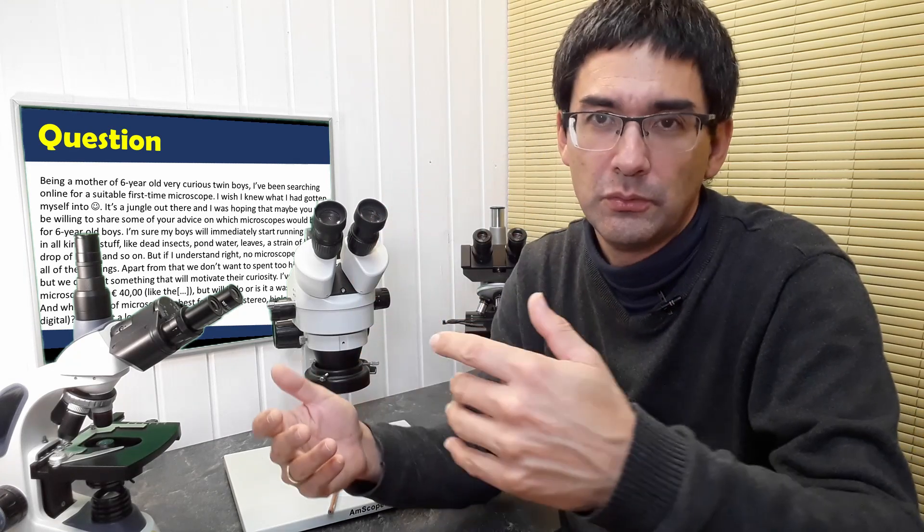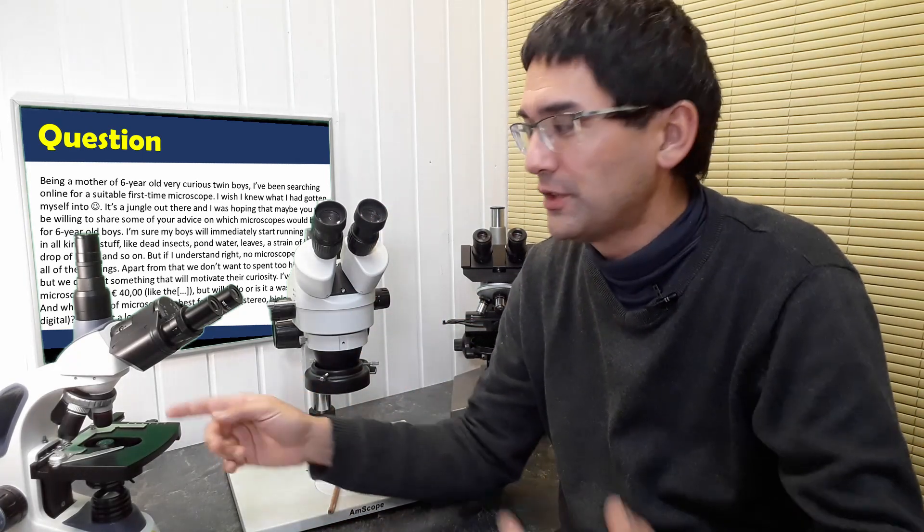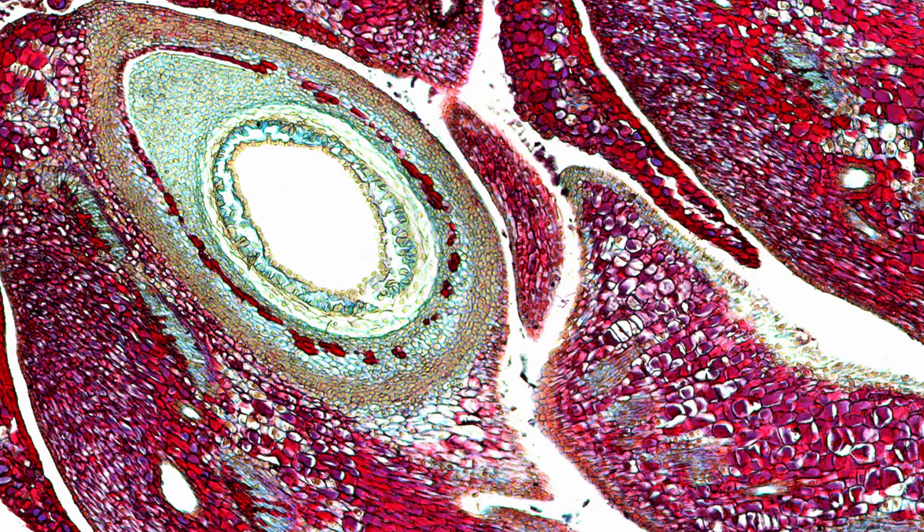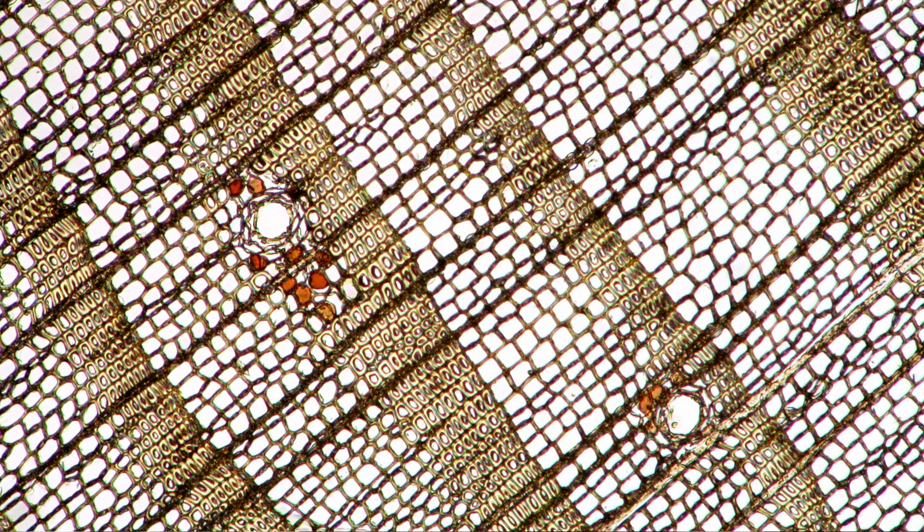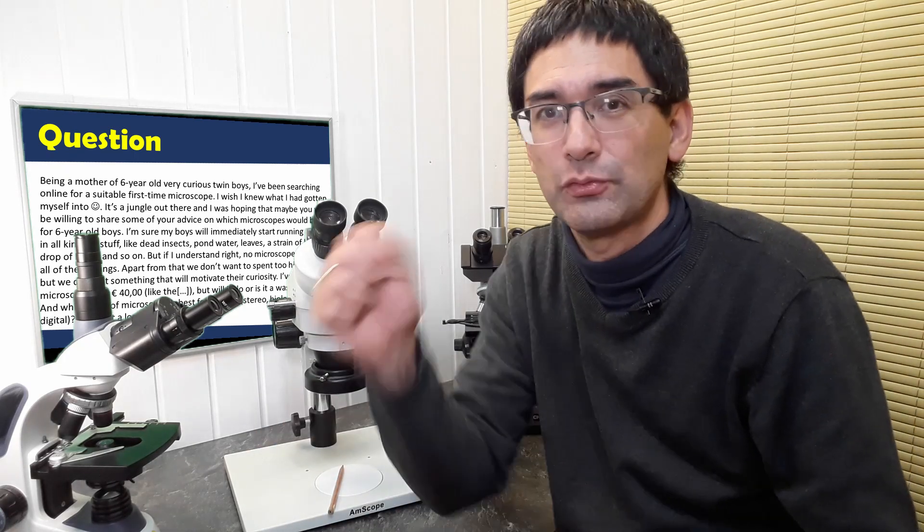But here you need microscope slides. And the object has to be very small. You get a picture that's turned on its head. It doesn't really matter because it's so small anyway, that you don't know what's right side up and what's flipped around. But the image is quite abstract. So you don't have, it's kind of distanced in that sense. I mean, okay. Then you're able to see maybe the red blood cells around little things. Interesting. That's it.